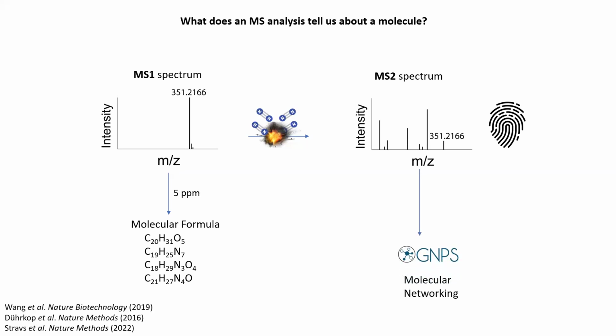an idea of the substructures. And so thanks to this one, we can perform, as we saw today, molecular networking. So we can connect them based on the similarity between the fragmentation spectra, which is translated in a similarity in the structures. So this is the correlation. This is the important thing.